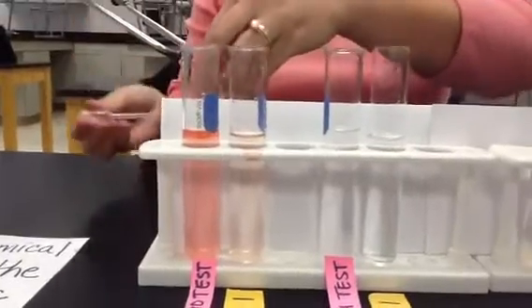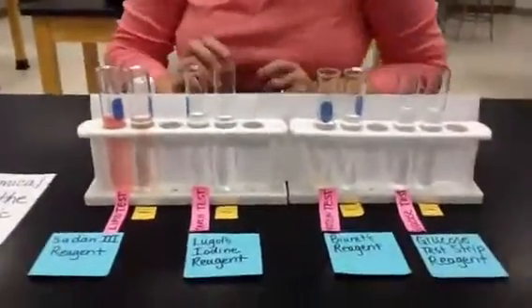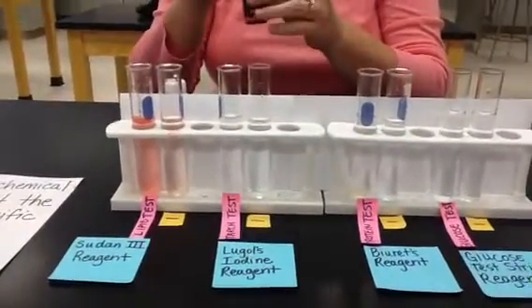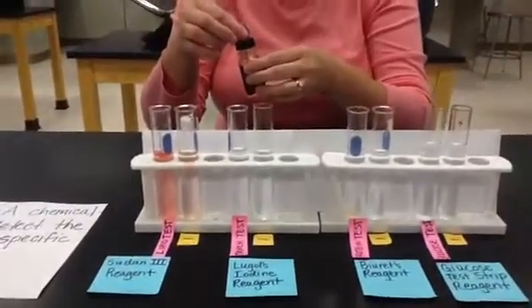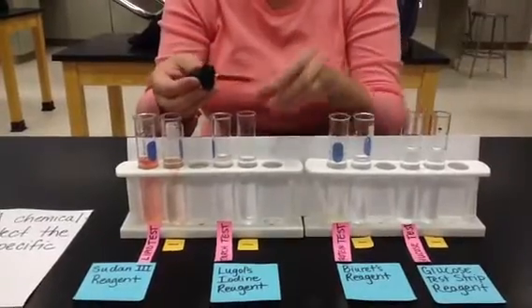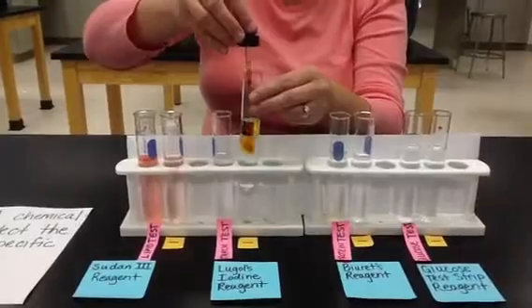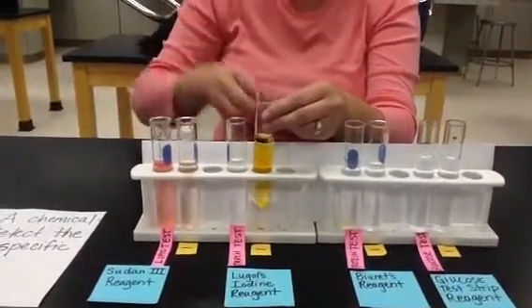All right, so let's go on to our next one. Our next one is our starch test, and we use Lugol's iodine reagent to test for the presence of starch. So we're going to start with our negative test. If it's a negative test, it's going to be the same color as our original reagent, which is kind of this light brown and maybe even pale yellow. So let's see what we get here.